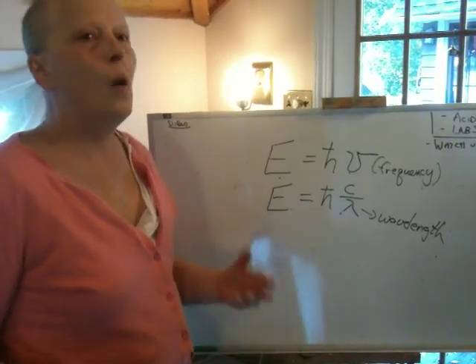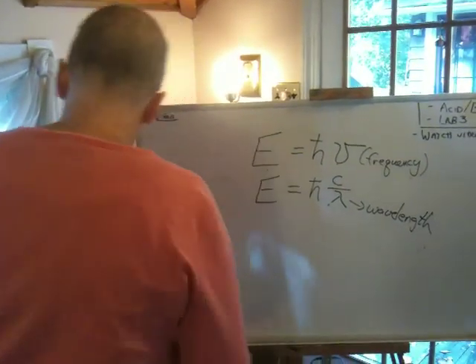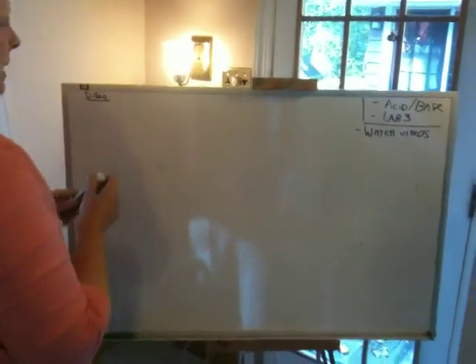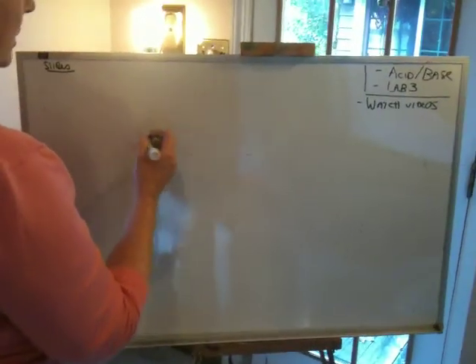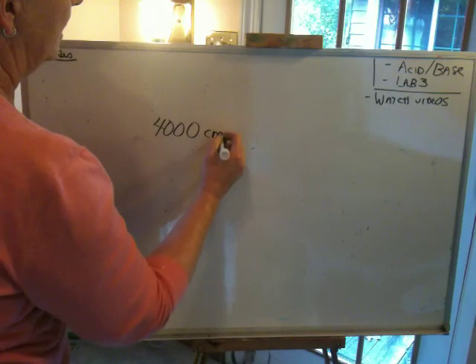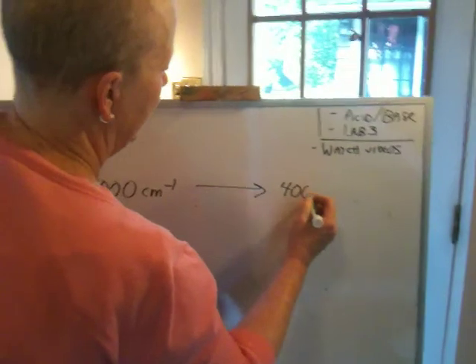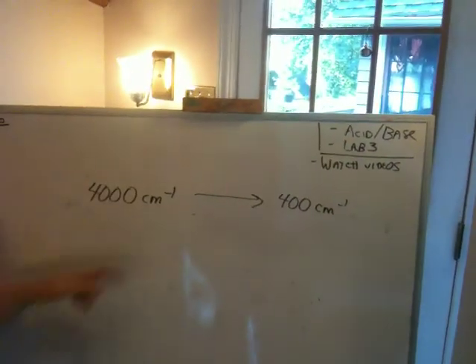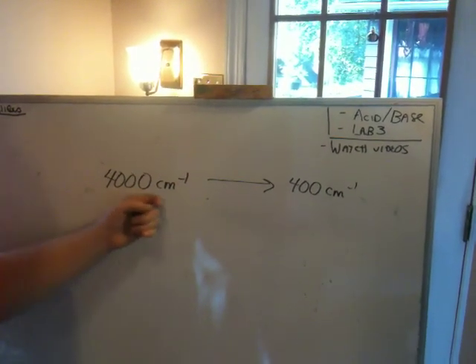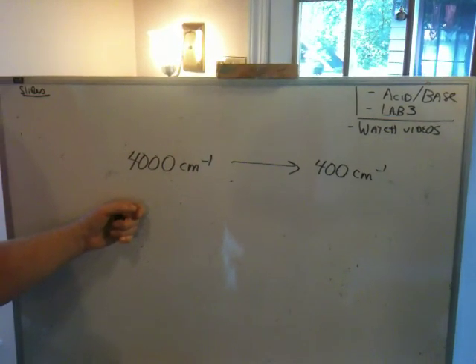Okay? Now, what does the infrared spectrum involve? Well, when you run an infrared spectrum, essentially what you're doing is you're exposing the molecule to a frequency range that is 4,000 reciprocal centimeters, or inverse centimeters, to about 400 reciprocal centimeters. Now, our current IRs, I would say, go down to about 600 reciprocal centimeters. So again, get in the mindset of a spectrum. We're talking about a spectrum here, okay?